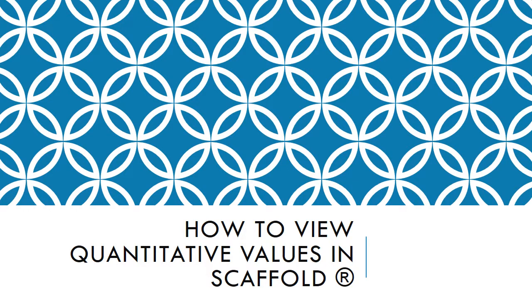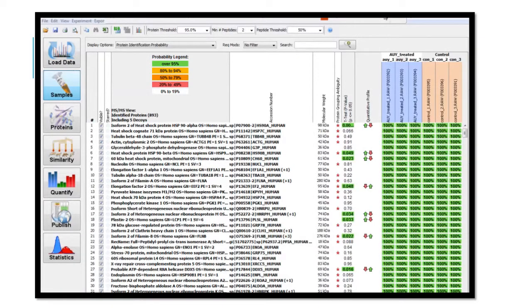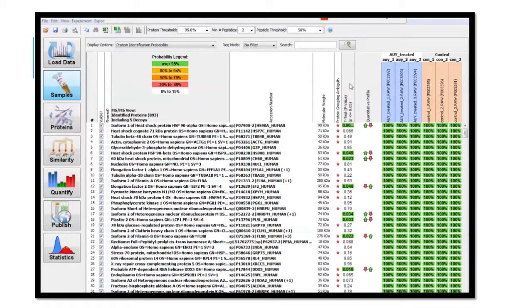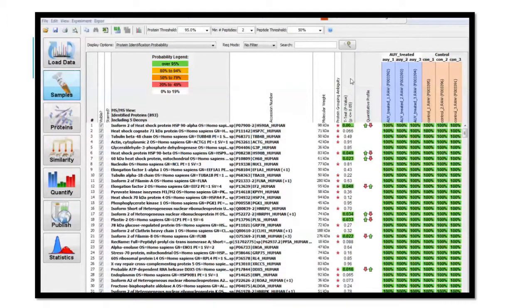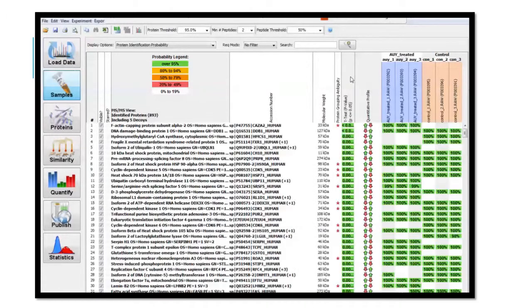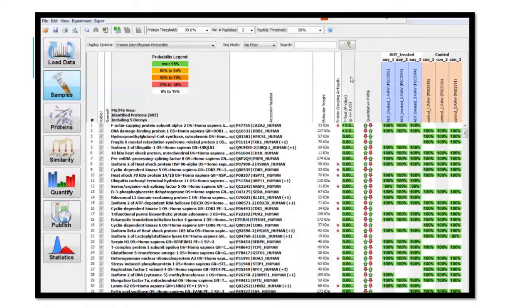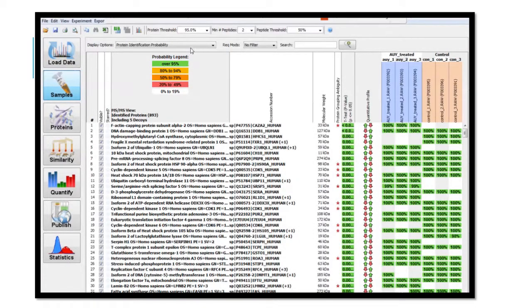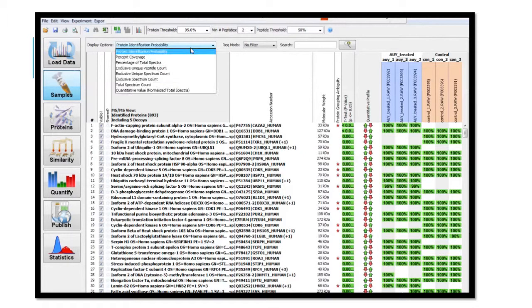This is a tutorial on how to view quantitative values in Scaffold. Once you have sorted the data based on the student's t-test p-values of less than .05, select the displays option drop-down menu.